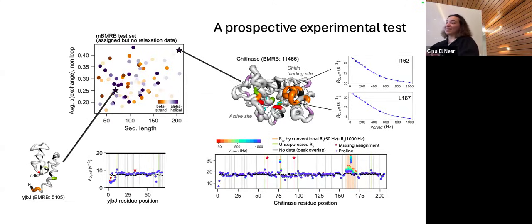Last question for me. A few people mentioned HDX. How different or similar is that to NMR, and is it more scalable? It's a different experiment. What would be the difference between NMR and HDX for data set creation? Would they capture similar information about what's missing? I'm not familiar enough with HDX to properly comment, but I would imagine they would tell different stories about the same protein, and different informative stories. It looks like we have an audience member who knows.